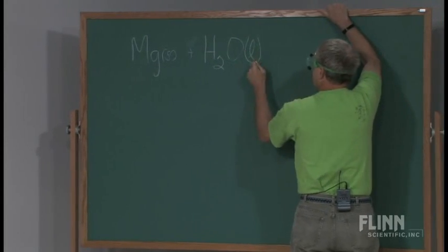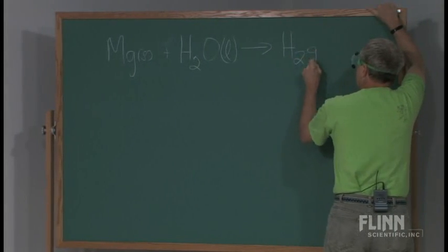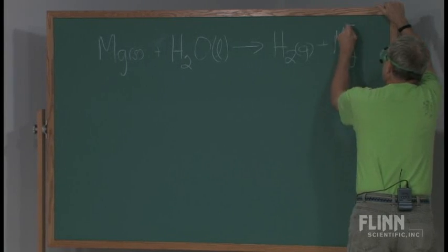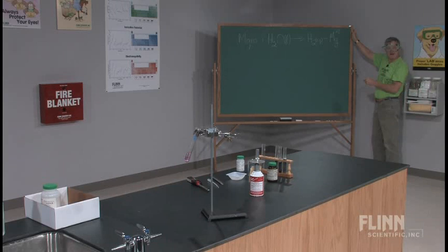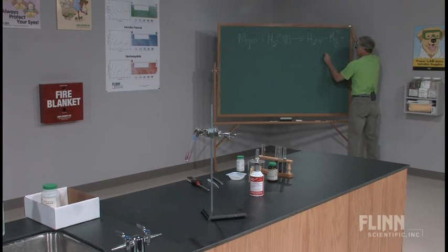Liquid generates hydrogen gas and magnesium ions. You ever seen that sign that says plan ahead? Well, I'm doing that really well here. And hydroxide ion.